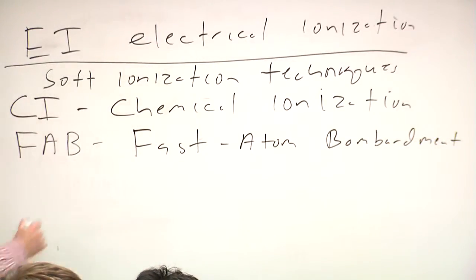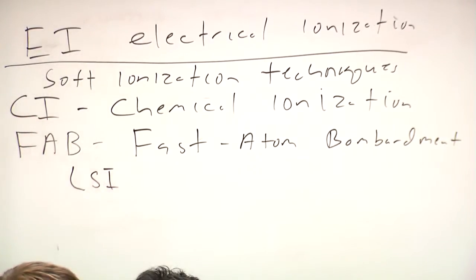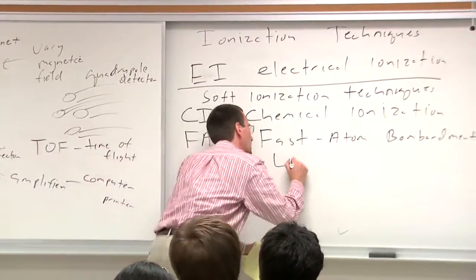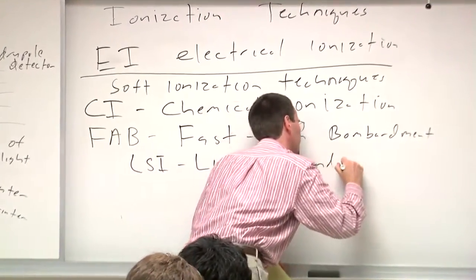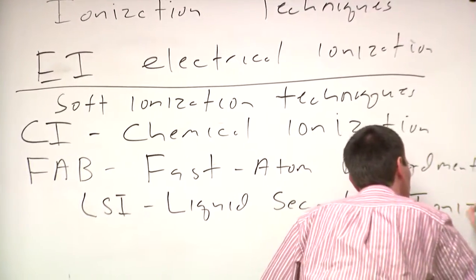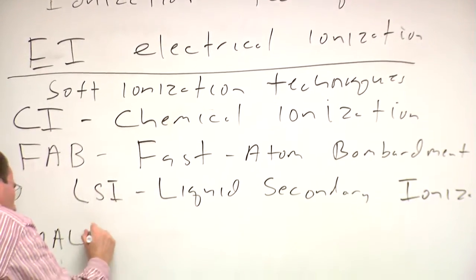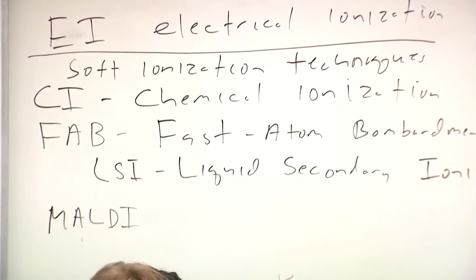There's a variant of this technique referred to as LSI. In one case, you're doing the business that I'll show you with an atom. In the other case, with an ion. And MALDI, M-A-L-D-I, is another technique for ionization and getting molecules into the gas phase.